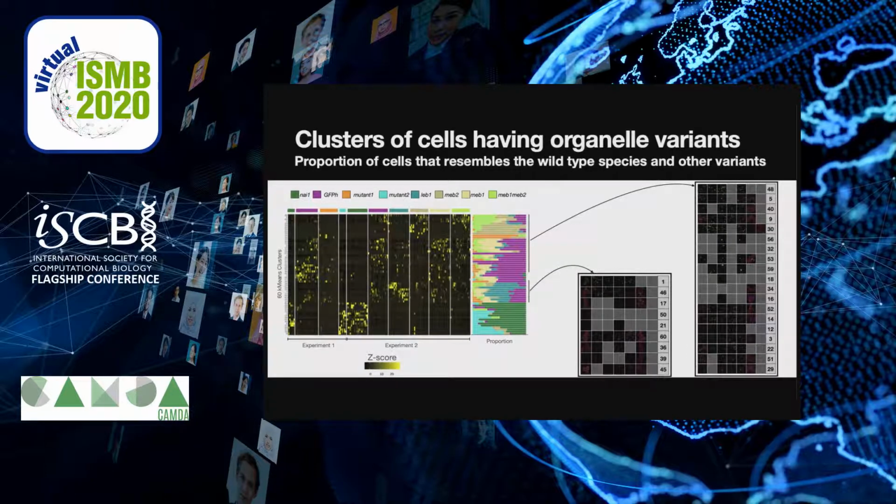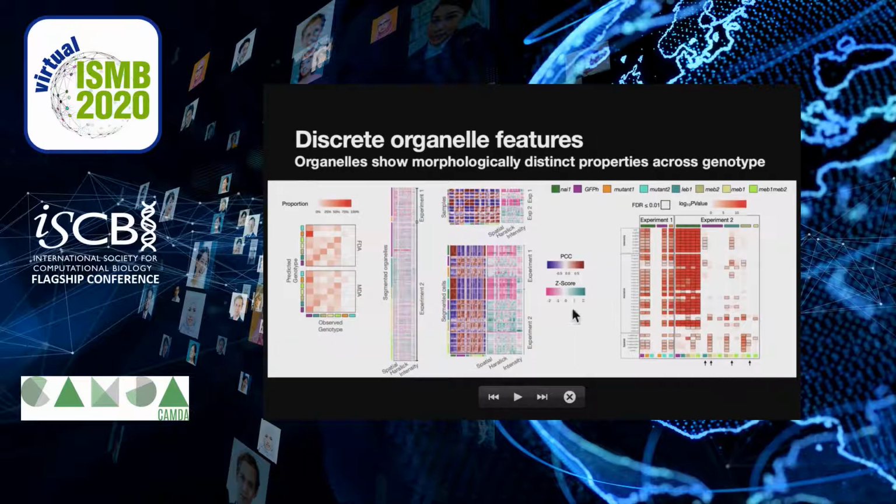We used the normalized feature matrix to compute k-means clustering and obtained groups of segmented cells that are similar to wild type and ER network. We considered the cluster representatives of the cells that are dissimilar to the null mutant, and further looked into the cluster representatives and observed that mutants indeed show morphologically distinct ER bodies compared to that of wild type. By discriminant analysis, we found that the ER body mutants have a proportion of cells predicted to be similar to the observed genotype, about 70%.